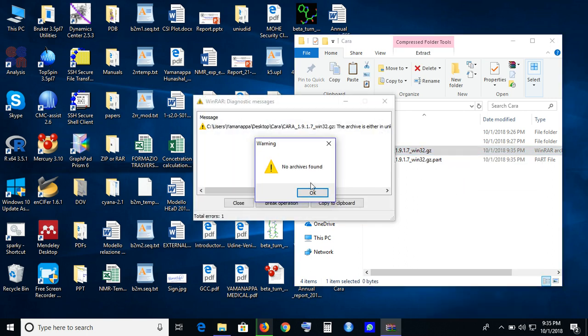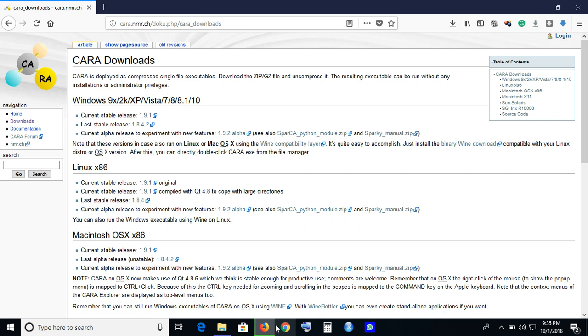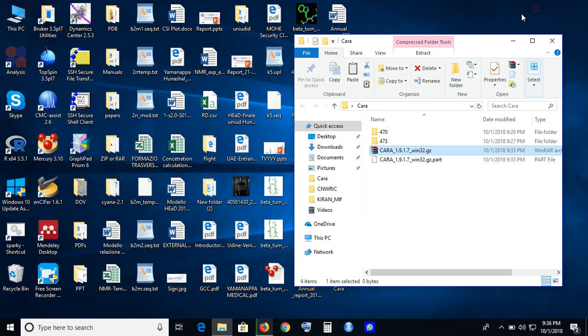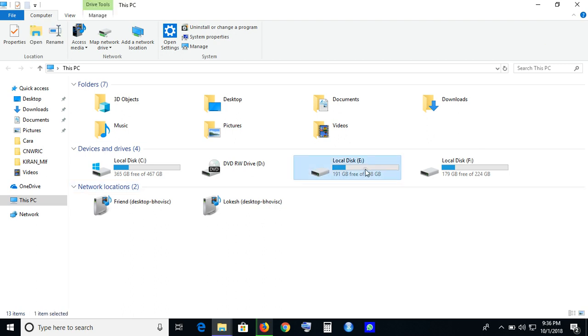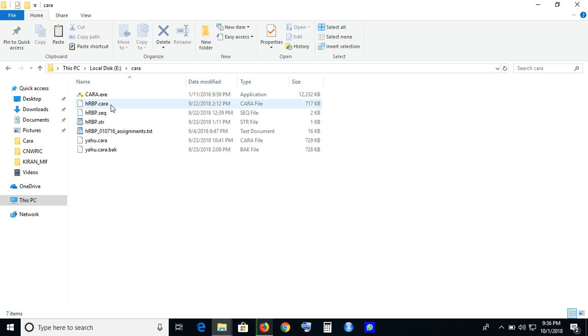Download. Still downloading. Okay, where is your Cara? Okay. Nice.